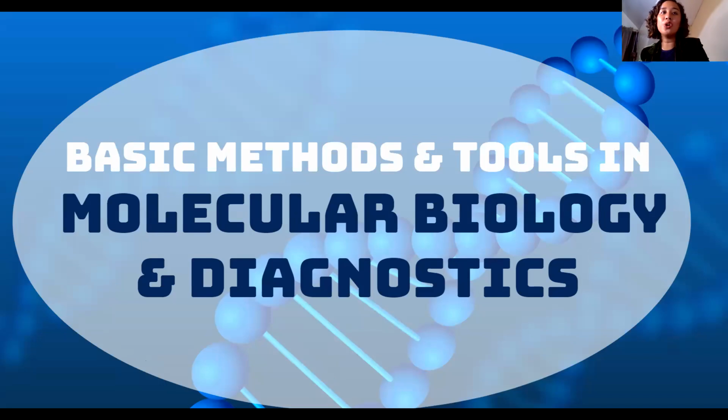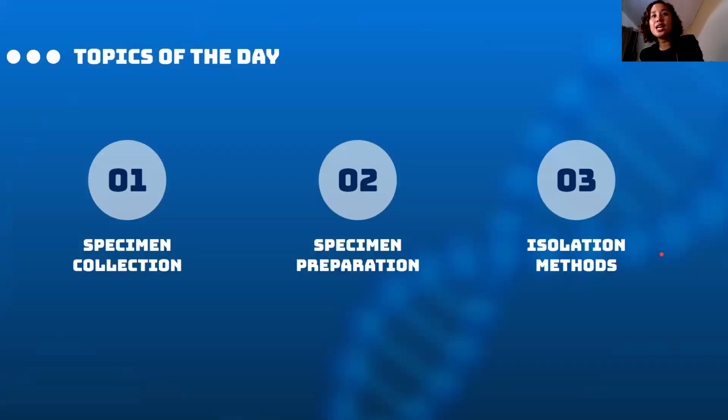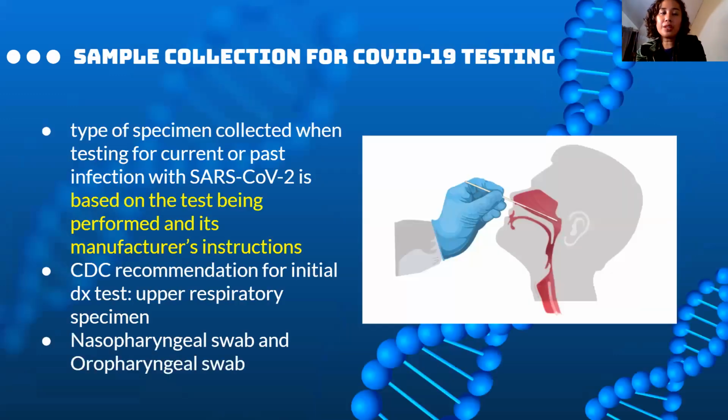So, samahin niyo ako. So, we are going to tackle basic methods in the molecular laboratory. So, magsimula tayo sa specimen collection, how it is prepared, and how DNA and RNA are isolated from your cells. So, first off is sample collection.